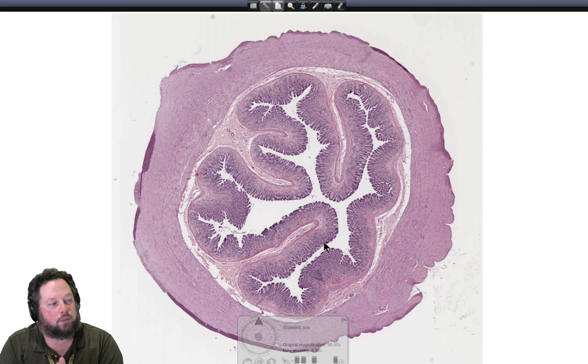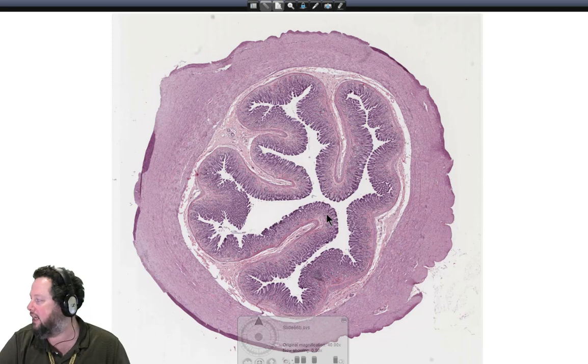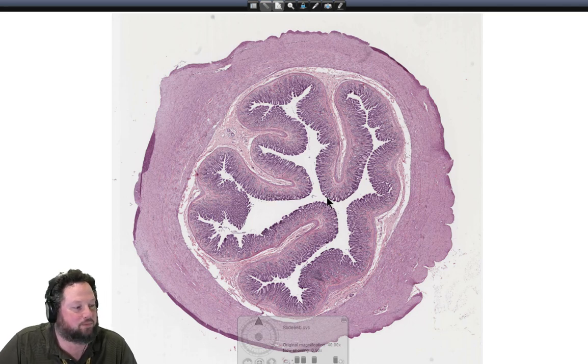Rugae, yes, Hibiscus, well done. Yeah, so they're called rugae. So this is a ruga, one of them. So you can see numerous rugae here. Izzy Rob, well done to support the people contributing in the chat. It's really great. Rugae, Histo 101, yes, correct, well done.